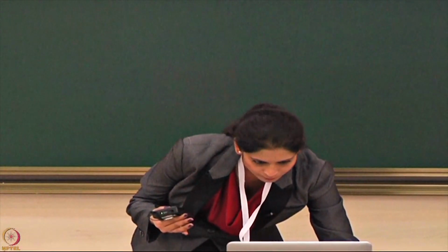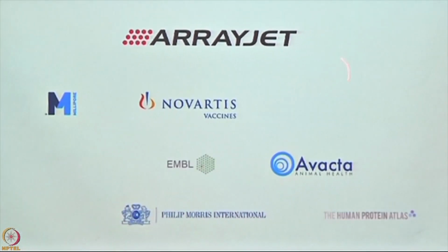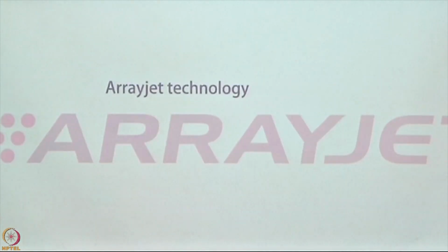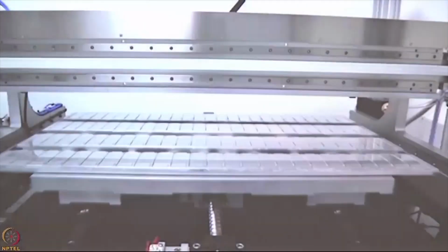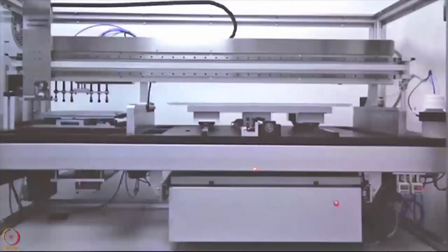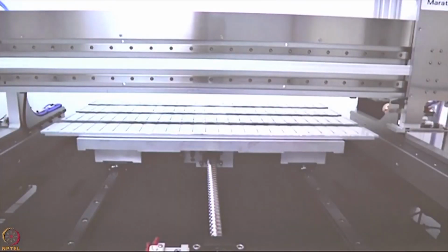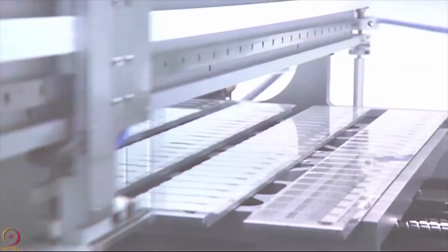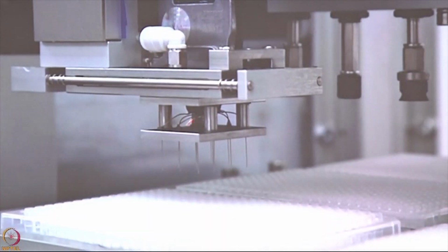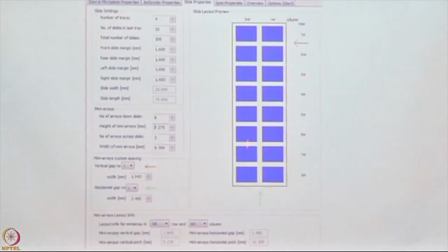Let me show you another video. This is how we have used a variety of different platforms or surfaces. This is the one that times you. So this video will give you a little bit of a timing. This is in fast motion, but within a minute you can have your entire panel of antibodies quickly printed. And you see how this is moving. This is how the aspiration takes place. Your sample goes inside the printhead. Then this is where it ejects out.